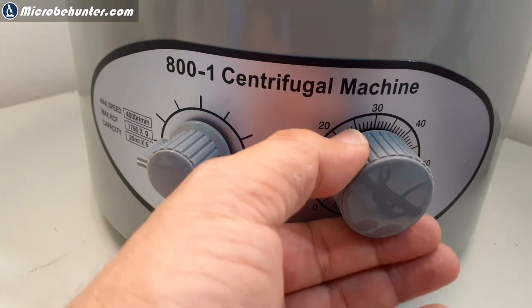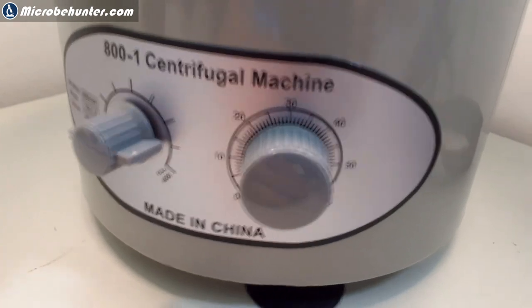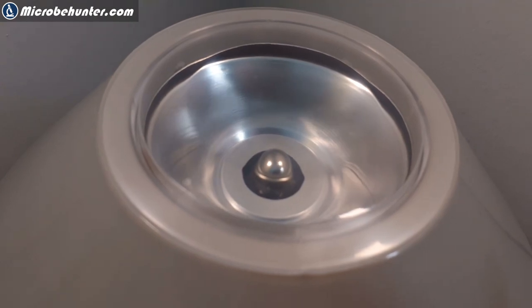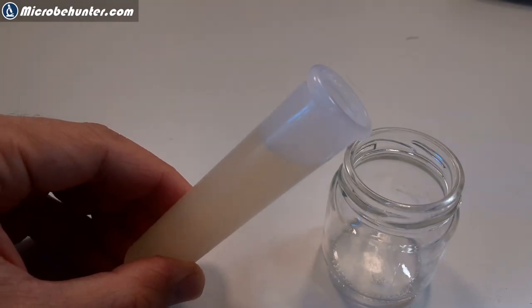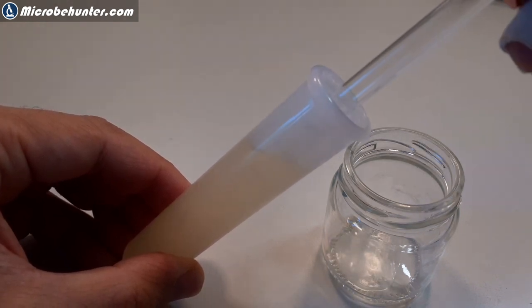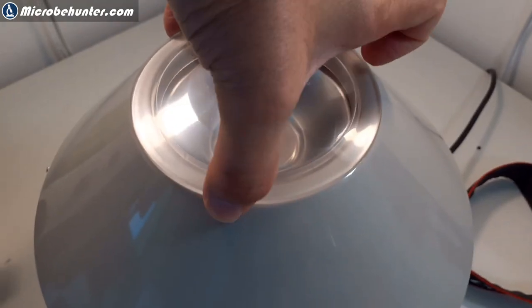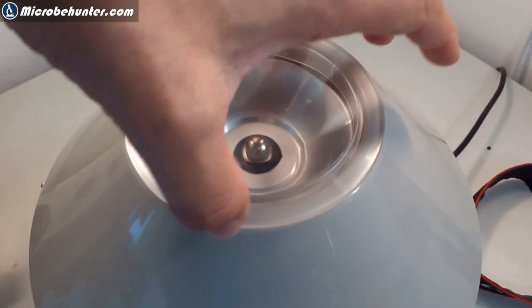I was spinning the whole thing for about 10 minutes or so. And then this is called the pellet. There was indeed something that collected there. So I had to carefully remove the supernatant — I did this using a pipette to not disturb the pellet too much. And then I did this a second time. I again added the honey-water solution. I made a little mess here. And there was a vacuum actually somehow, so the lid was actually sucked down and was not so easy to remove.